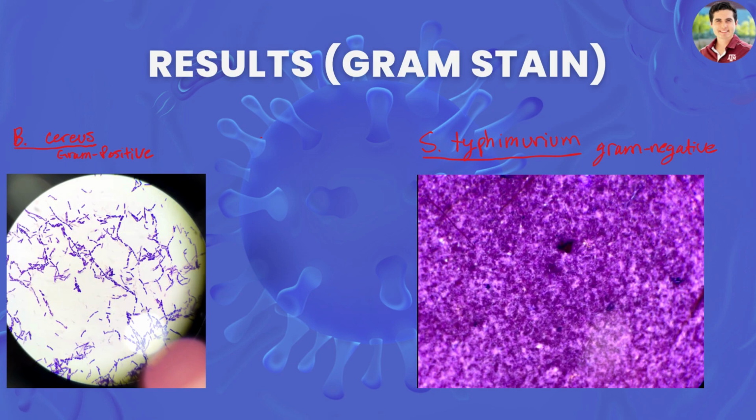Perhaps this may happen because during the gram staining process, the crystal violet stain initially colors the cells purple, but when washed with the decolorizer of acetone, the outer membrane probably wasn't as disrupted and didn't allow the stain to completely wash away. So therefore, maybe this is why it appears a little bit more purple.